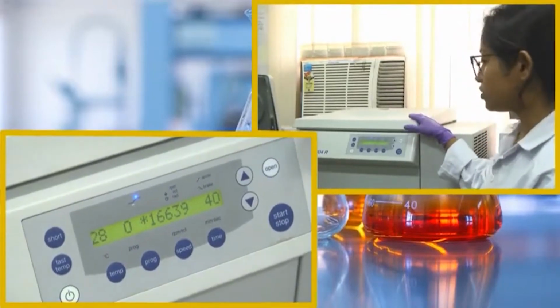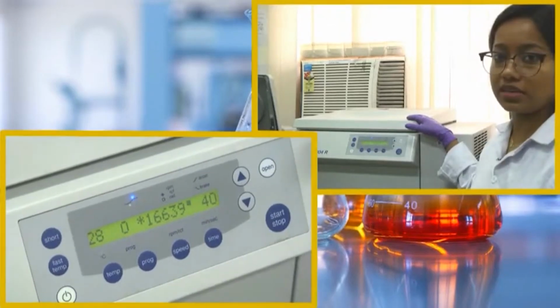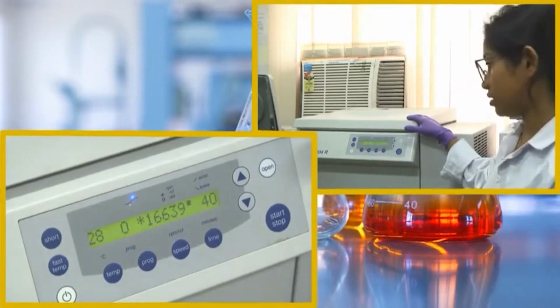After 40 minutes we will divide the whole solution into a supernatant and a pellet fraction, and we will see what we will do. While the centrifugation is happening, we will make the preparation for the next step.